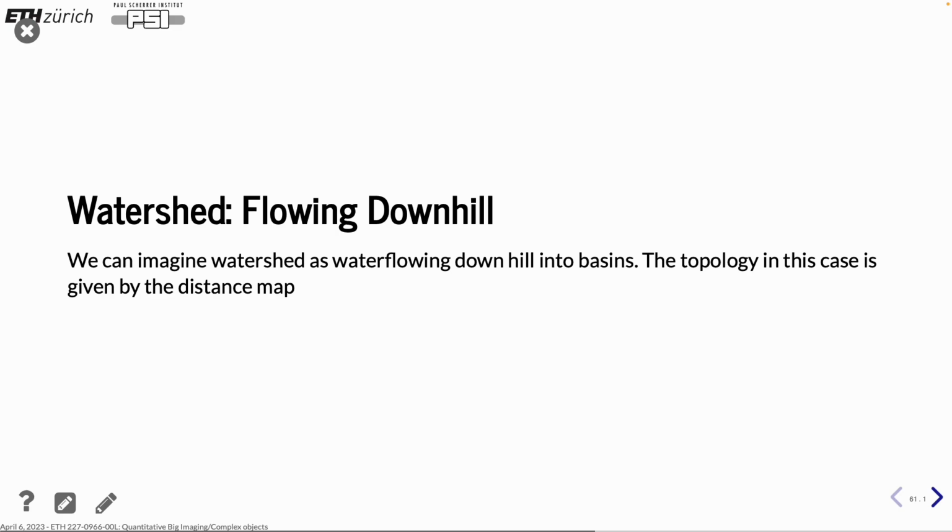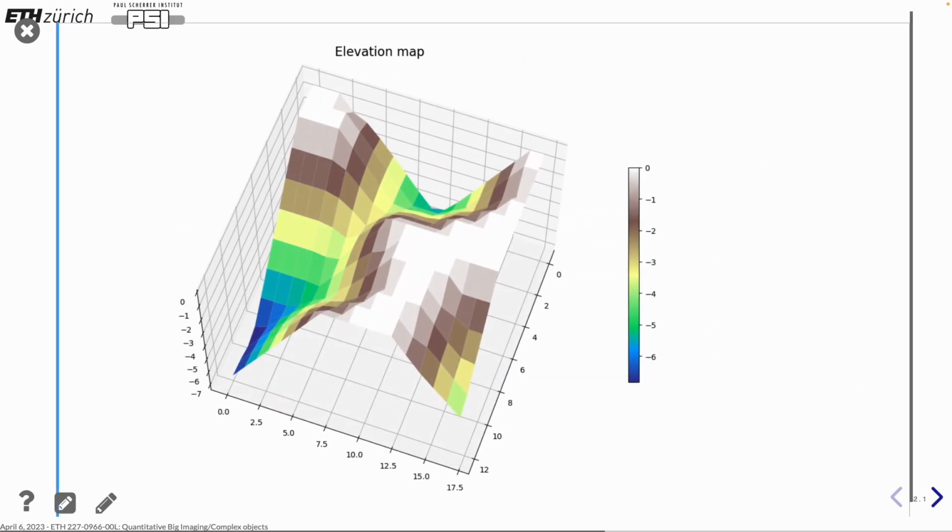And the Watershed algorithm is an analogy to water flowing downhill in a mountain area. We have the ridge of the mountain, and water will run down into one of the valleys, the catchment basins. In our case, we create this landscape with the help of a distance map. So what you see here is actually the distance map of the cell image extract that we did before.